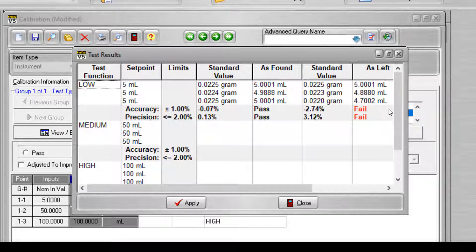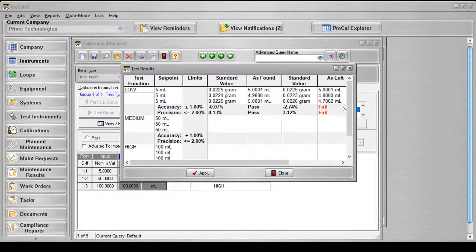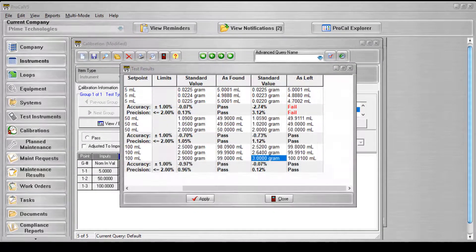The grid will only accept numerical inputs in decimal form. After entering each value, the unit of measurement will be automatically added to the display. All standard value, as found, and as left readings are required for a successful calibration record entry.